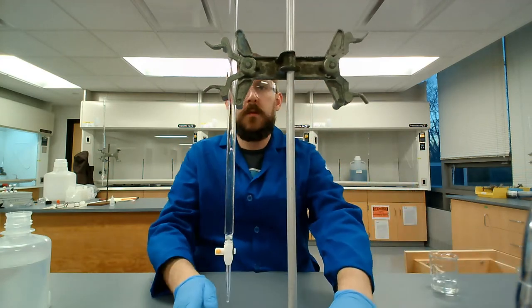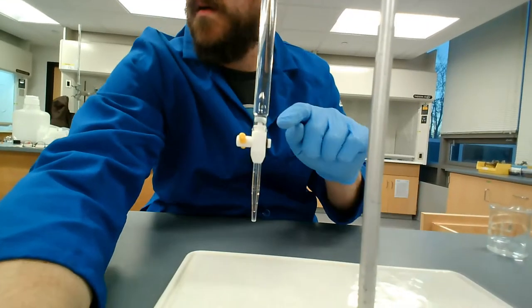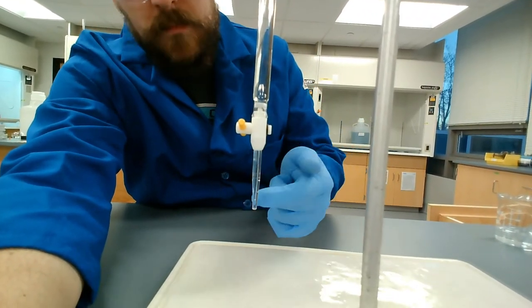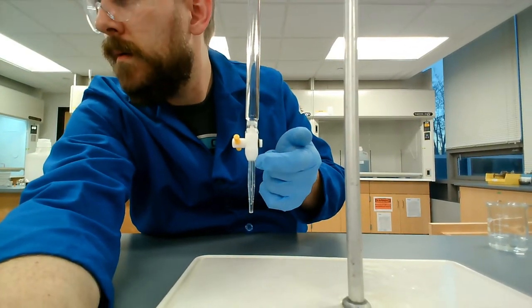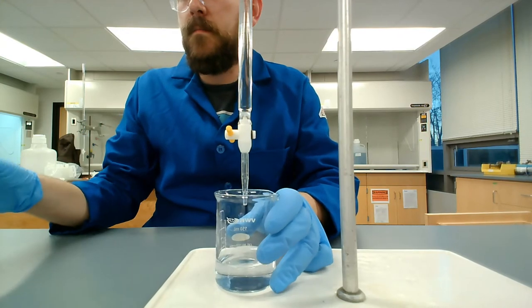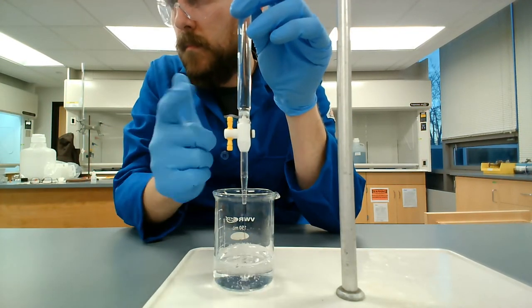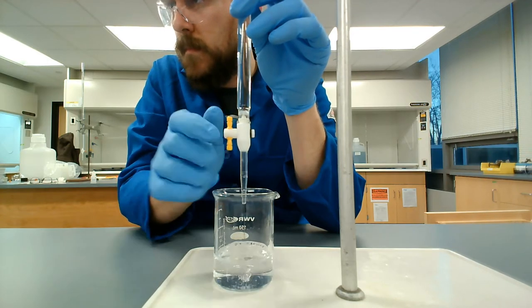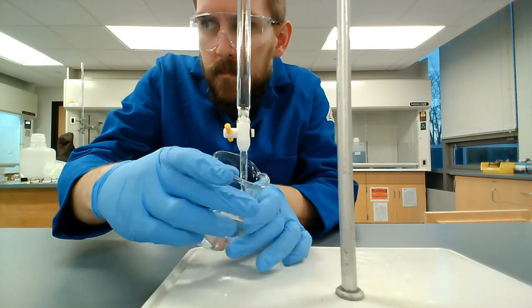So, last bit of prep before I start doing some titrations. I'm adjusting the camera so you can see. There is a giant air bubble in the tip of this buret, right? Which is bad. We need to be dispensing sodium hydroxide out of the buret. We don't want to dispense air into our titration. So I'm going to open this thing wide open. You saw a bunch of air bubbles come through, and give it a couple of soft taps to coerce any stubborn bubbles that are still trapped, right?